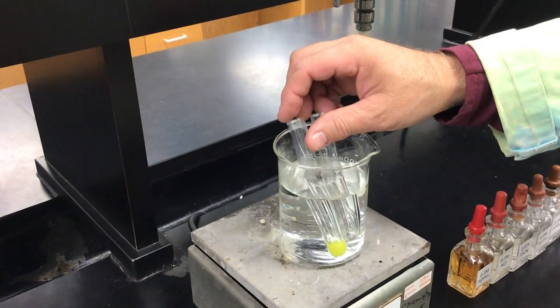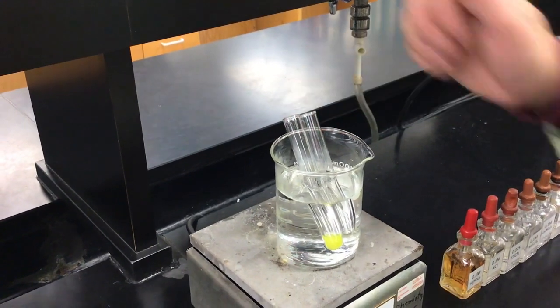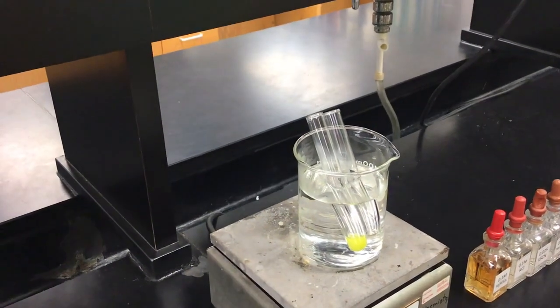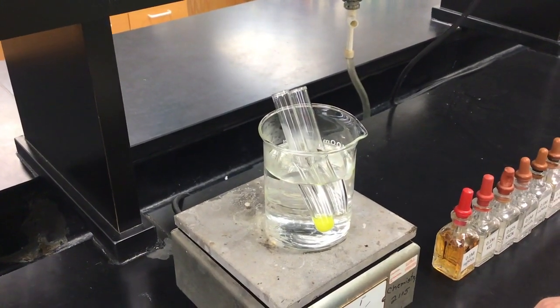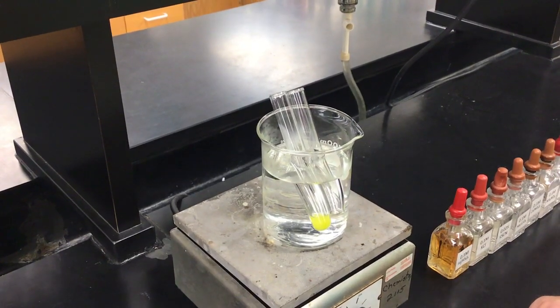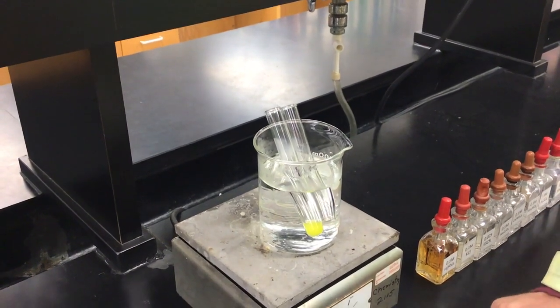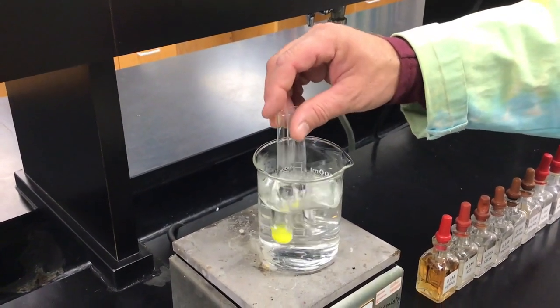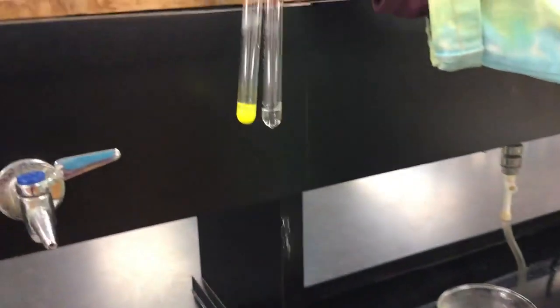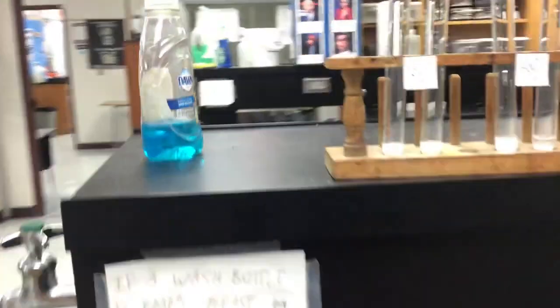So I could let them rest in there. The one on the left here, the yellow one, of course, is our known, and over here is our unknown. I'm not timing it, but I'm thinking 45 seconds. Yeah, maybe. I don't see much happening. I don't see anything going on there either. Move it around in here and see. Take them out and look against the background here. Write down what you see if you think you saw a reaction taking place. Presence of phosphate, yes or no. Okay, so that finishes up A1.